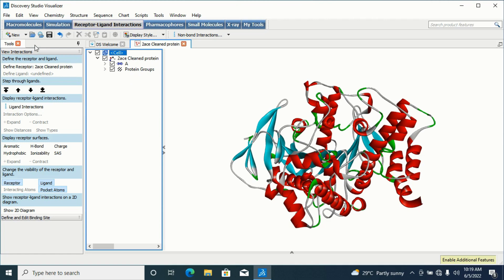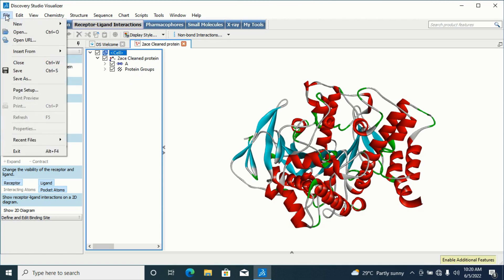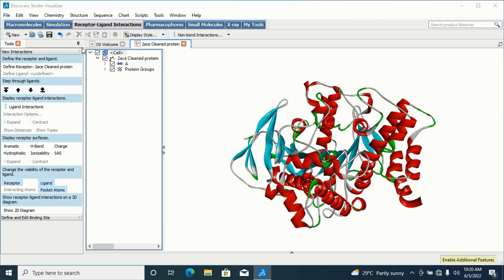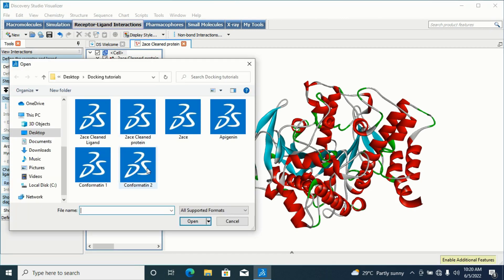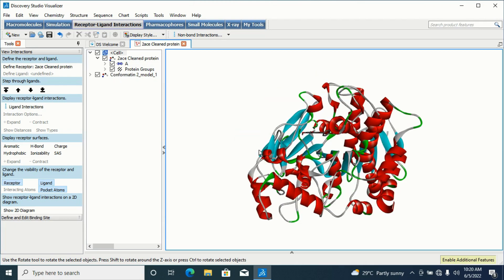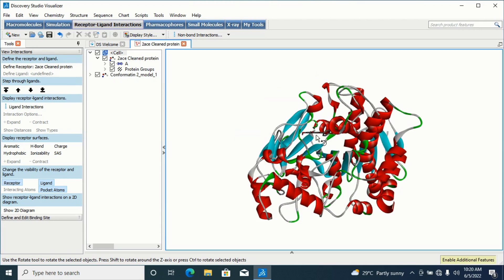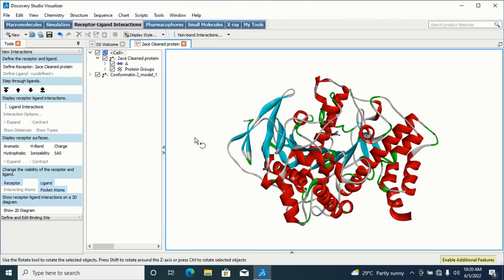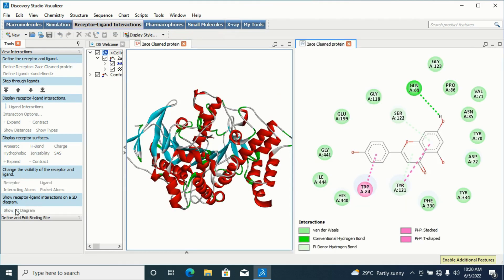To insert the second conformation, go to File, Insert From, then Insert From File. This time select 'Conformation 2', click on it and open it. Conformation 2 has been inserted into the active site. I'll generate its 2D diagram to see what the interaction looks like.